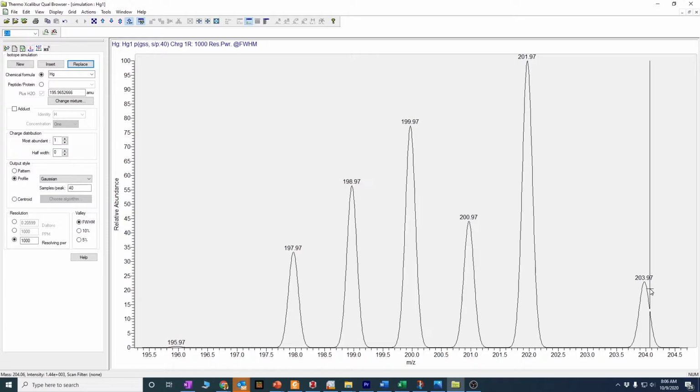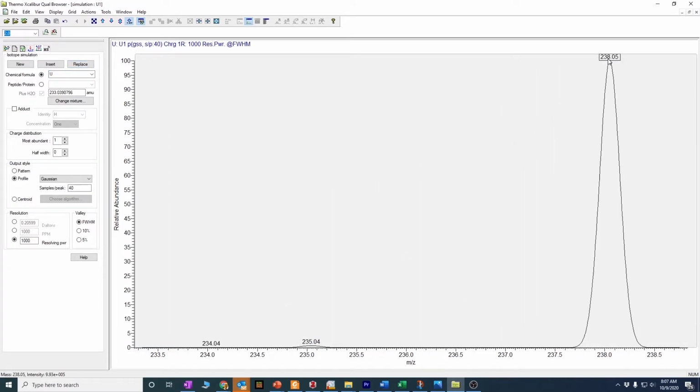you can look at uranium ratios. Uranium is naturally supposed to have this 235-238 ratio, but if you are enriching it for use in weapons, then they intentionally enrich it, which means they increase the amount of the 235 isotope relative to the 238 isotope, because 235 is more fissile. So uranium 235 is going to be enriched in weapons and things.